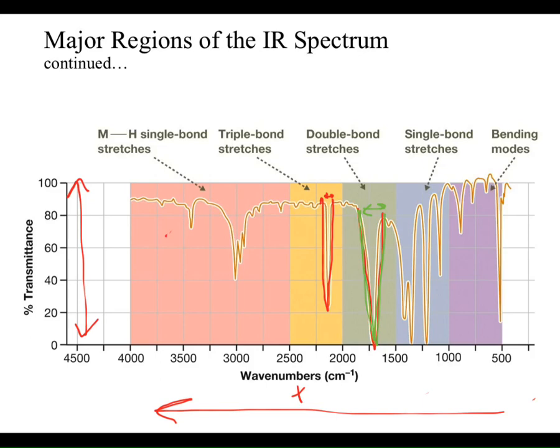And that's it. Okay? So when we talk about IR spectroscopy, it's really just a game of matching. Is it strong, medium, or weak? Is it broad or sharp? And that's it. Okay? There are other things that we can factor in. The last big one, which is probably going to be really important for you, is, as a general rule, about 1500. You will see when you look 1500 and lower that you get a crap ton of peaks. You get so many peaks and so many different things happening in there that it usually takes an expert to actually interpret that. Ask yourself, are you an expert?